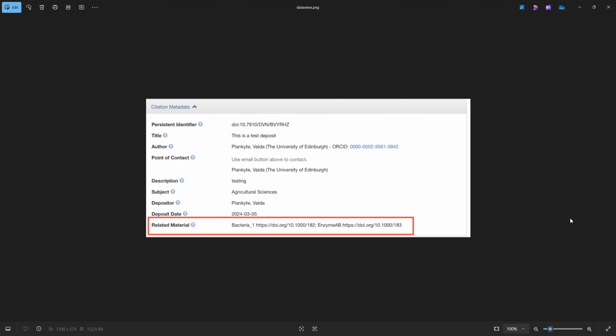We are also working on extending this workflow to include repositories, so that documents exported to a repository would also contain metadata on linked samples in the form of IGSN IDs.